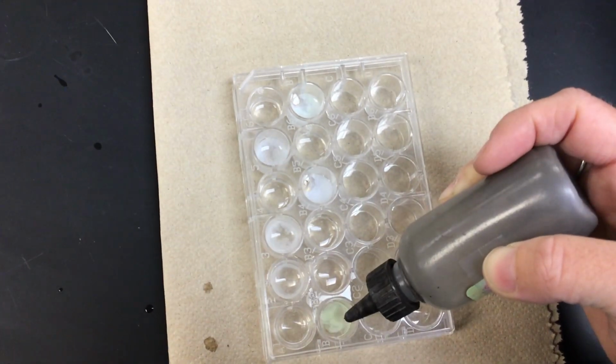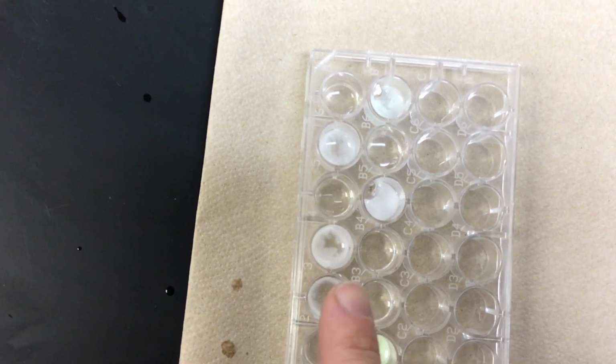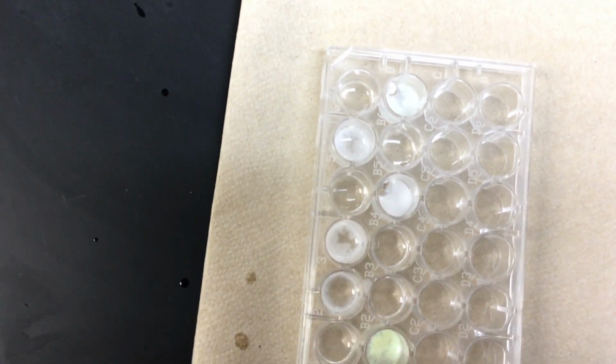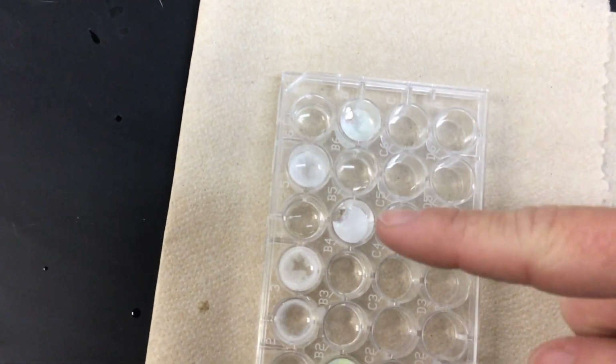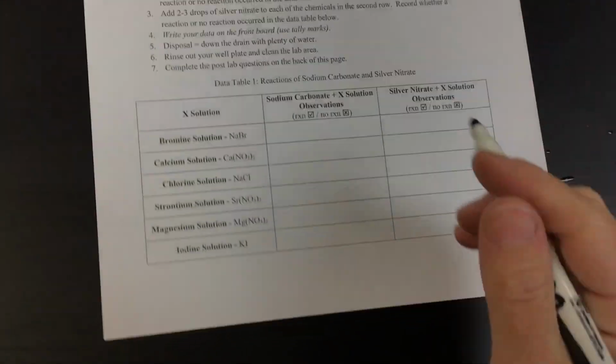Okay. And so we can see how these reacted. The first column reacted with the sodium carbonate in the second, fourth, and fifth well. And then the second column reacted with the AgNO3. It was the first one that reacted, the third one that reacted, and the last one that reacted. So we're going to write that down in our data tables. This is really hard to do.